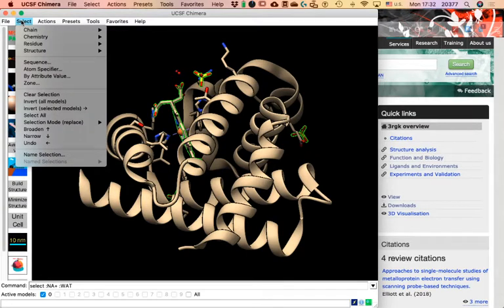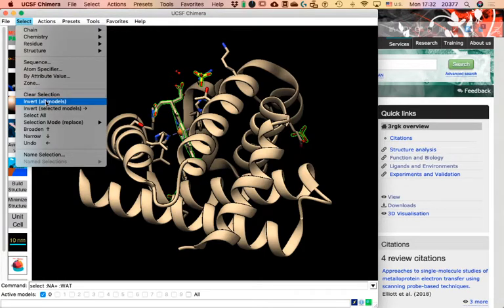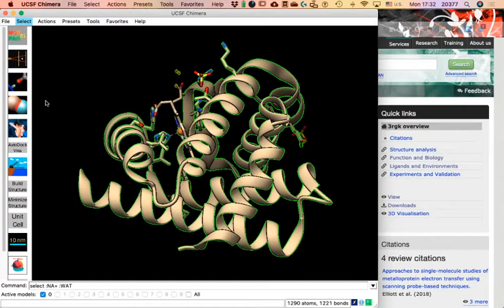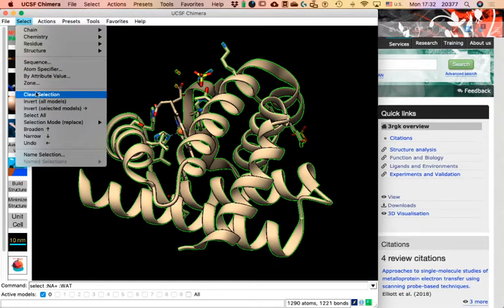We can select by sequence, by atom, by attribute; we can erase our selection, invert the selection, or select everything, among many other things. For example, if I invert my selection, the selection will take everything that is not a ligand — so now the protein and water molecules are selected, but not the heme and not the sulfate. I'll clear my selection by going to Select > Clear.